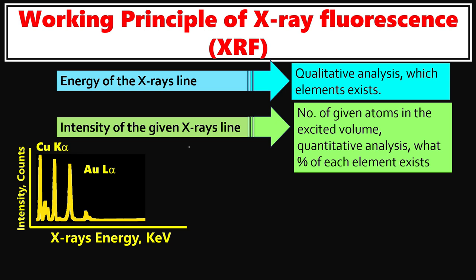How X-ray fluorescence is a more powerful technique than other similar techniques, because we know there are similar techniques like EDX, sometimes called EDS, which is also used for elemental analysis. This technique is usually performed along with scanning electron microscopy analysis. And we know these techniques are basically performed using electrons.